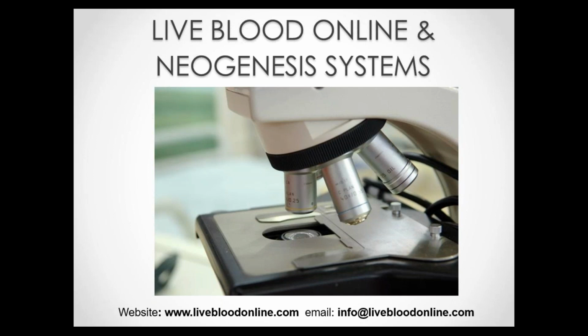Well, in terms of what it involves, it's basically a visual analysis conducted on two blood samples, a live blood sample and a dry blood sample. The live blood part of the test involves looking at the live blood sample under fairly high magnification using two types of applications in microscopy, namely bright field and dark field. The dry blood sample is viewed after the live blood sample under fairly low magnification, looking at the specific patterns of coagulation in the dry sample.